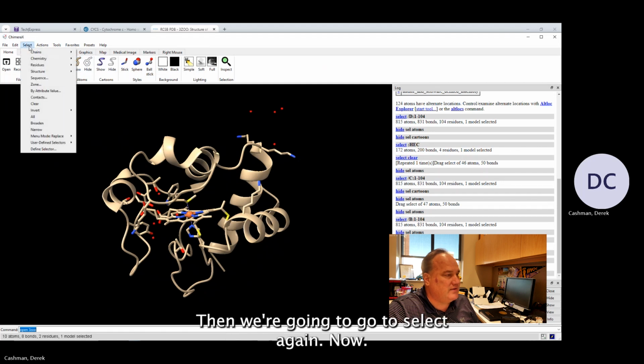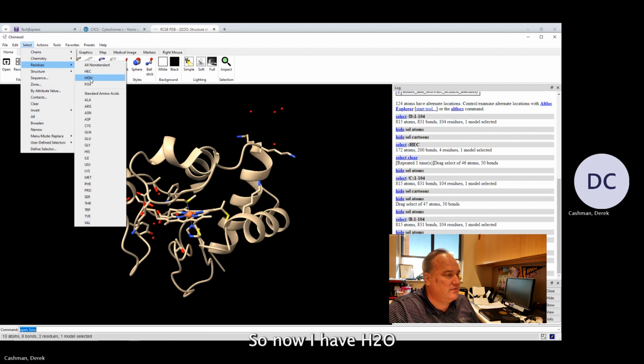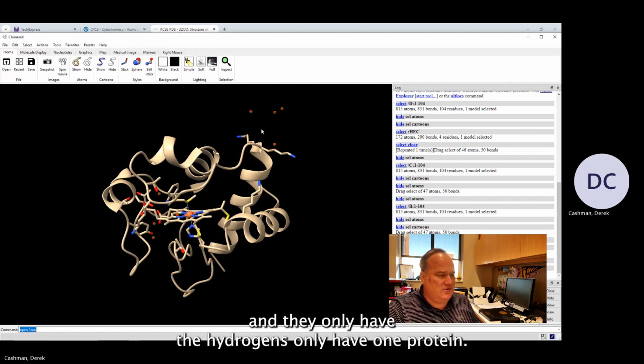Then we're going to go to Select again now. And remember, we had water in there. So now I have H2O. And interestingly enough, this is only the oxygen atom of the H2O. And with only the oxygen atom present, that means, well, where are the hydrogens? Well, if you remember, this is an X-ray crystal structure of the protein. And X-rays are so small, and the hydrogens only have one proton.